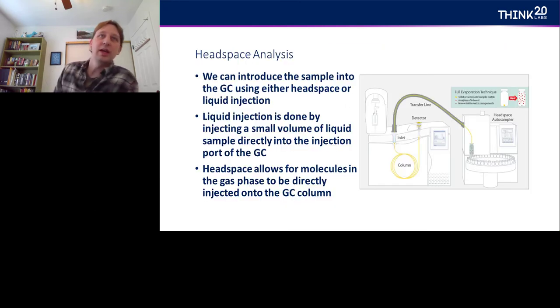So we're going to start with the sample injection system. So you can see all the way on the right, this is a 40-unit carousel. We have a 110-unit carousel in our lab, which basically allows us to run continuously. So the sample is put into a 22 milliliter vial and sealed, and then it's rotated into the autosampler oven, where it's baked for 10 minutes at 160 degrees Celsius.